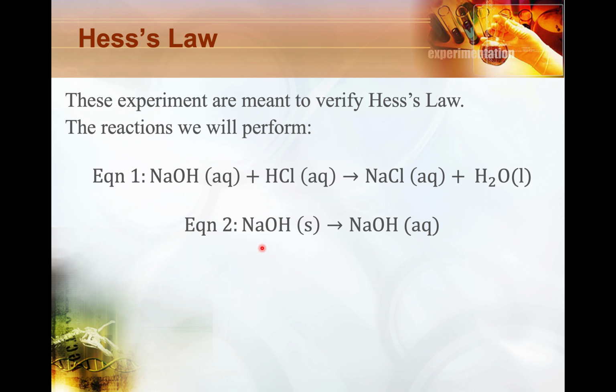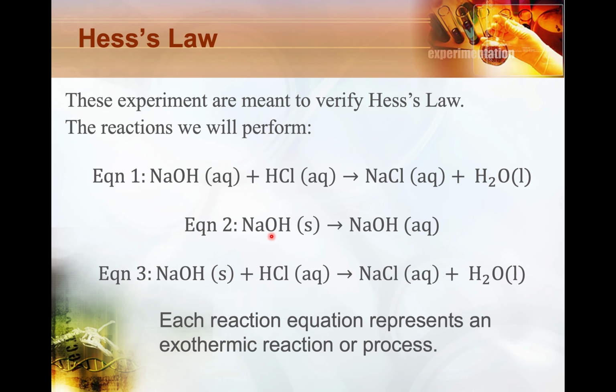If you remember from the titration lab, the solution actually gets warm when sodium hydroxide dissolves. We're going to do a third reaction where you'll do the dissolution of the sodium hydroxide, starting with the solid, not the solution, and then putting that into a solution of hydrochloric acid to do the same neutralization reaction.